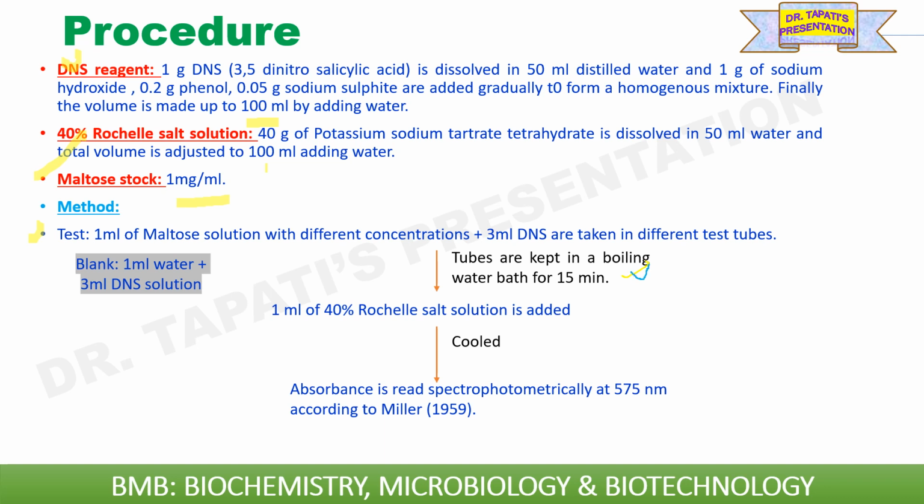After 15 minutes of boiling in the water bath, we have to add 1 ml of 40% Rochelle salt solution, and then we have to cool it.